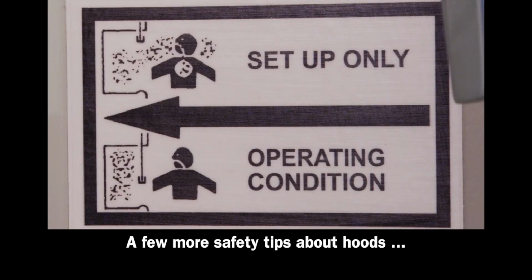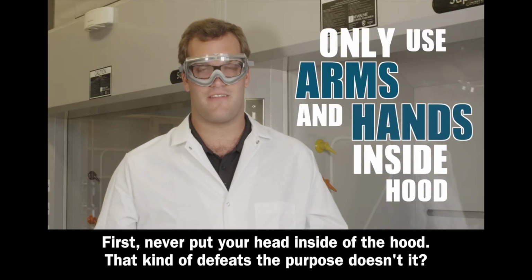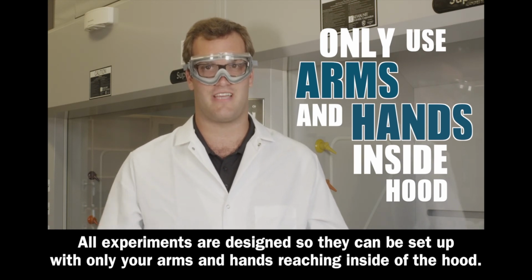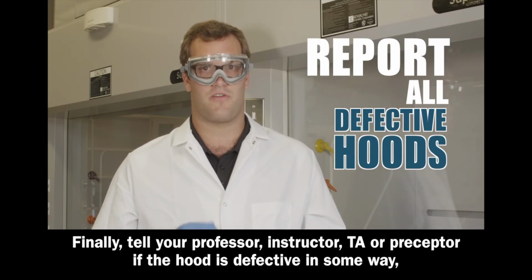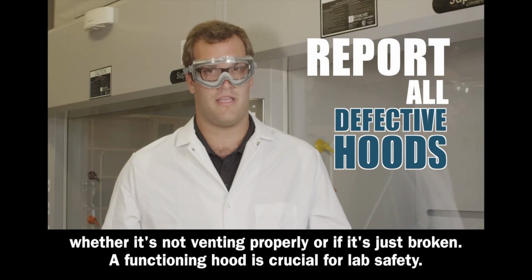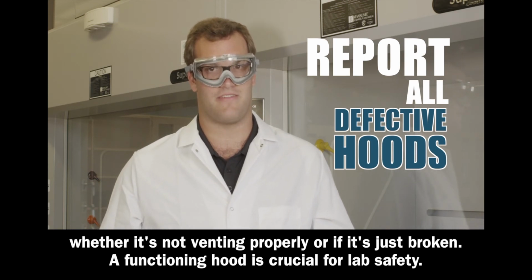A few more safety tips about hoods. First, never put your head inside of the hood. That kind of defeats the purpose, doesn't it? All experiments are designed so they can be set up with only your arms and hands reaching inside of the hood. Second, never use the interior of the hood as a writing desk. Finally, tell your professor, instructor, TA, or preceptor if the hood is defective in some way, whether it's not venting properly or if it's just broken. A functioning hood is crucial for lab safety.